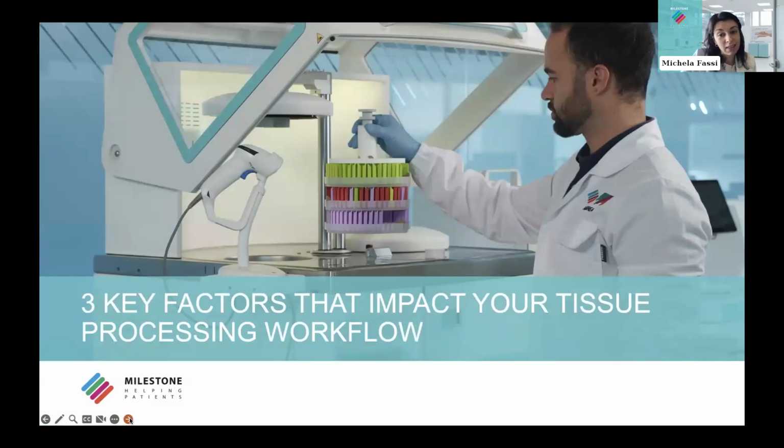This webinar today is dedicated to the 3 key factors that impact on your tissue processing workflow. And we will discuss together with our application specialist the key elements to see when you do your tissue processing.